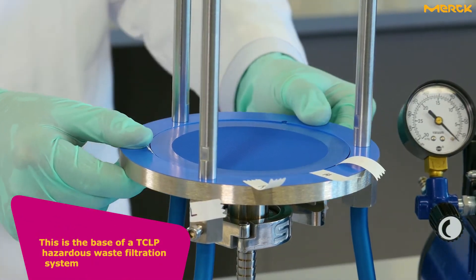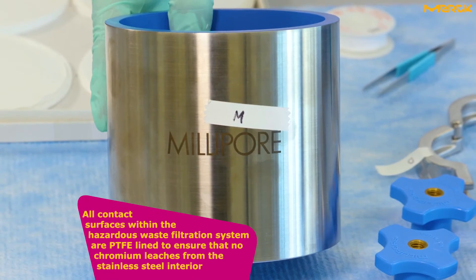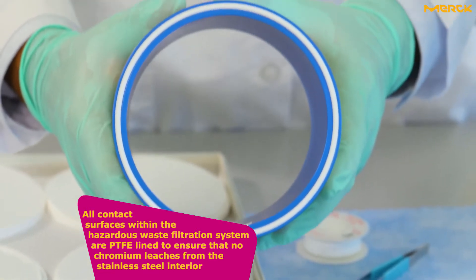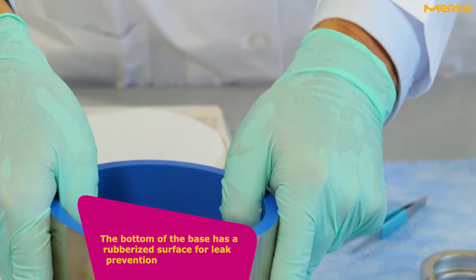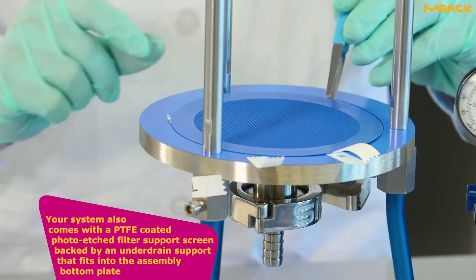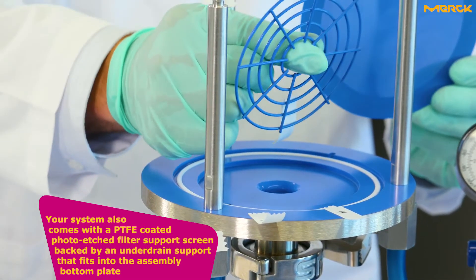This is the base of the TCLP hazardous waste filtration system, and this is the system cylinder or barrel. All contact surfaces within the hazardous waste filtration system are PTFE lined to ensure that no chromium leaches from the stainless steel interior. The bottom of the base has a rubberized surface for leak prevention. Your system also comes with the PTFE coated photo-etched filter support screen, backed by an under drain support that fits into the assembly bottom plate.